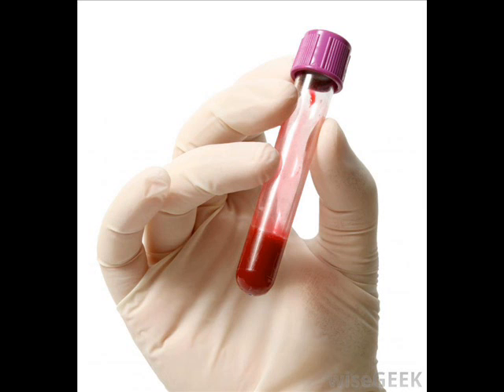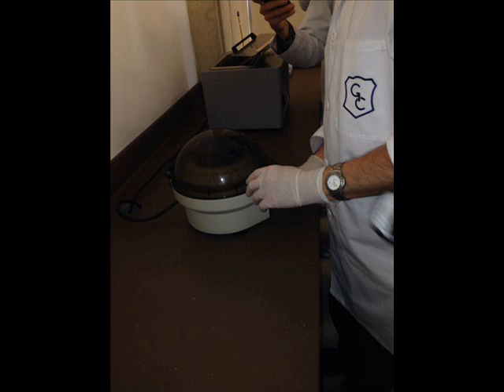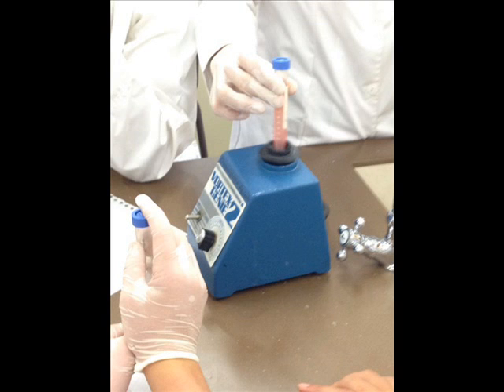We took the blood sample and applied it into 11 milliliters of TE buffer to reach a volume of 13 milliliters in the test tube. Then we shake softly and centrifuge the sample at 4,000 RPM for 10 minutes. After that, we took the test tube out of the centrifuge and added 1 milliliter of lysis buffer and applied it into a vortex for 1 minute.